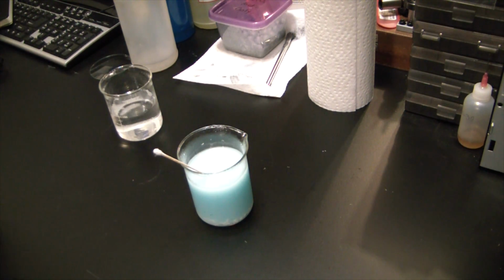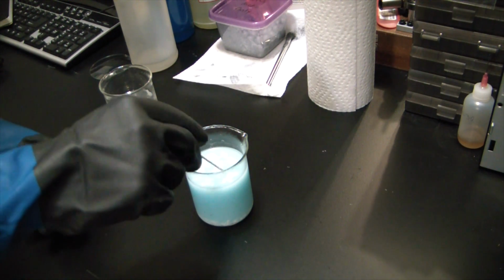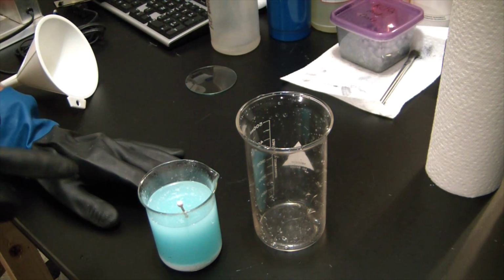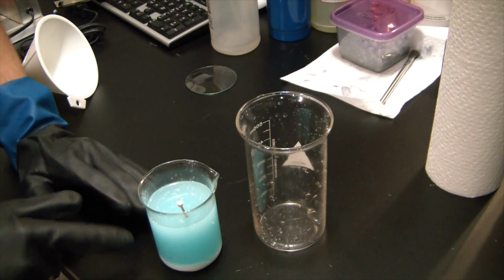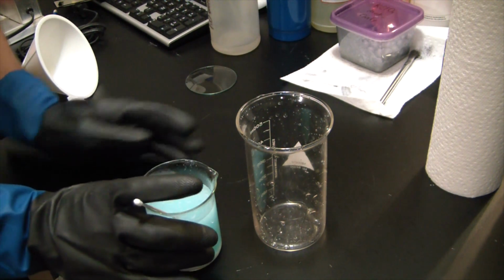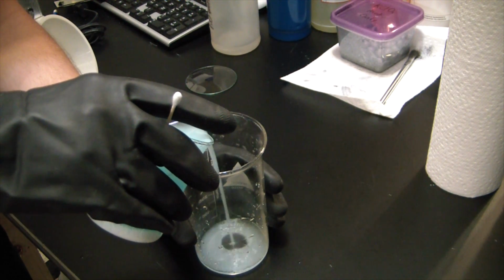So I'm going to give this a minute to settle and then come back, add a little more salt solution to it and see if I have all of the silver chloride out of solution or if there's still some left in there. I added a little more sodium chloride solution. It didn't produce any more precipitate, so I know all the silver is out of solution. It's still a little milky, which is telling me there's still some silver in the solution, but I'm just going to call that a loss because I'm not really going for efficiency here, and decant off the liquid layer.